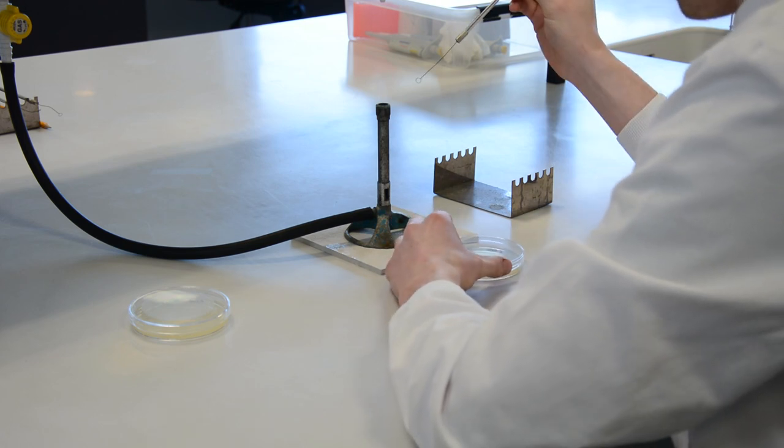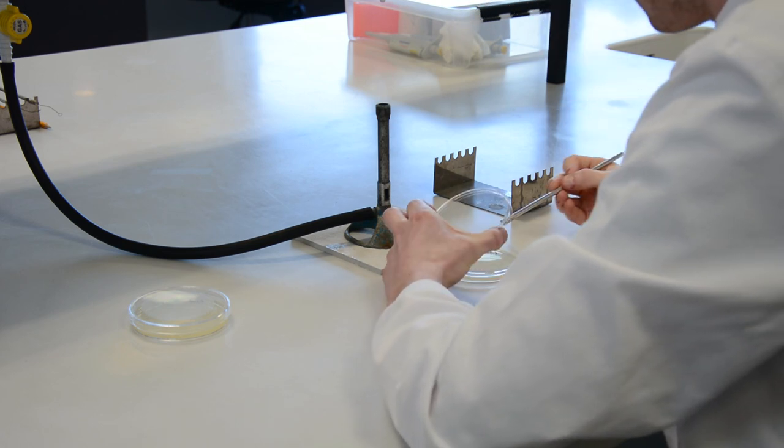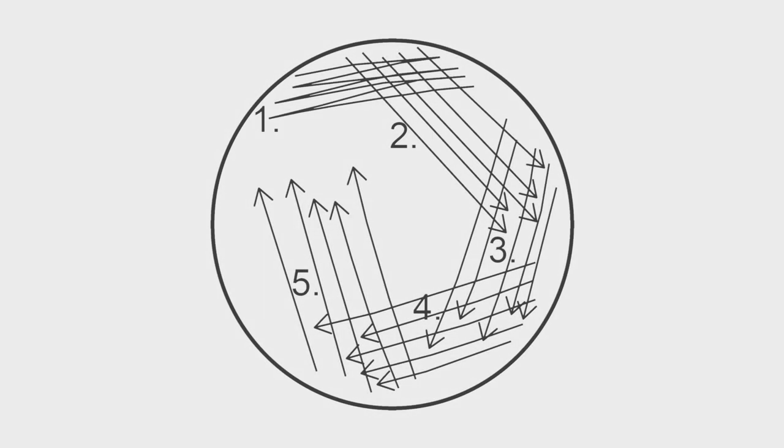Finally, the loop is sterilized and once more used to streak the culture into the remaining un-inoculated part of the plate, as shown in part 5.